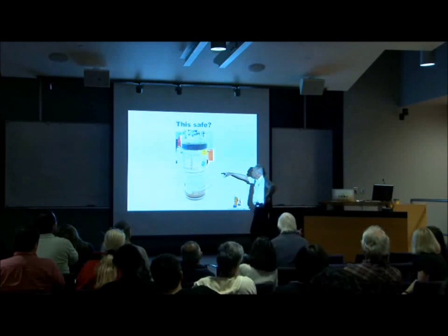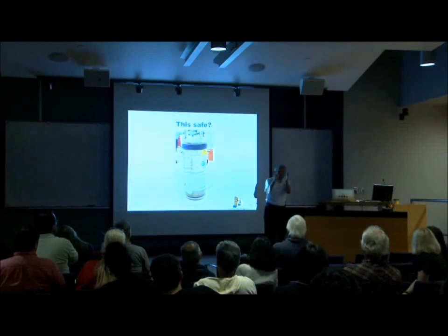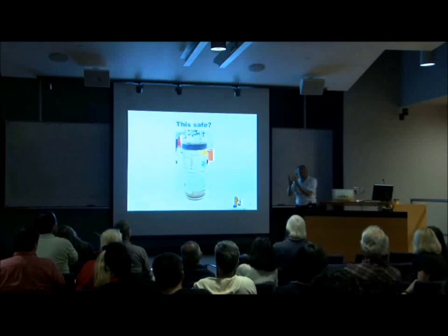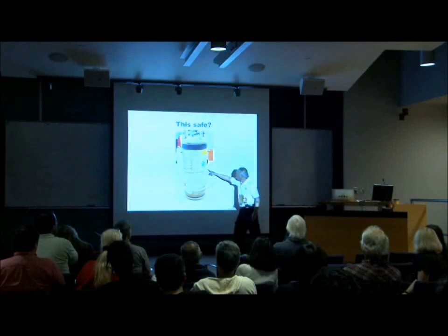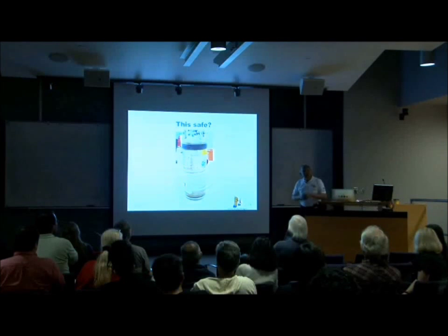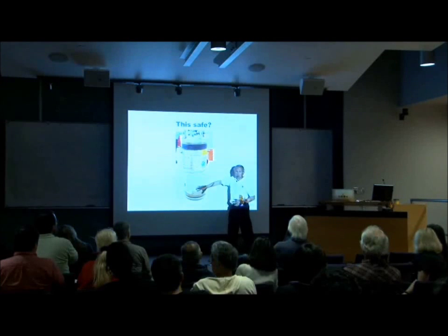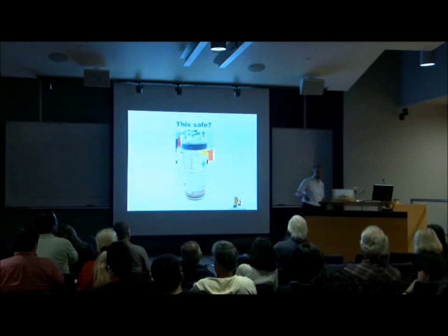For some dewars, they actually have a pressure building coil in between the two vessels. And what that does is, if you're using a lot of gas, it'll take some liquid and vaporize it in the coil. And this is essentially the outline of the coil that's underneath the surface. Now, if you've lost the vacuum on that dewar, the entire surface would be frosted rather than just the outline.